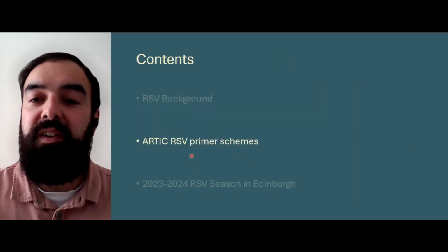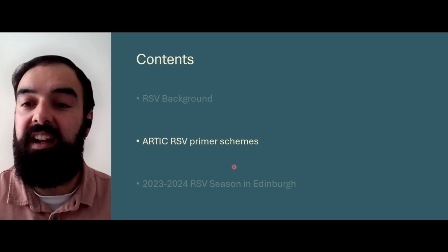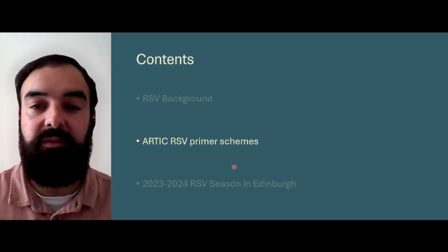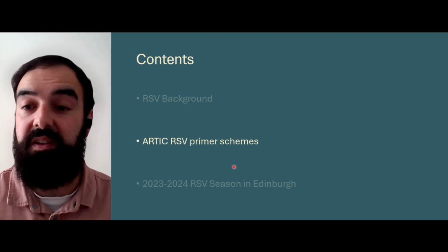So now that there's renewed focus on sequencing RSV in order to monitor how it changes as new pharmaceutical interventions come online, we felt there was a renewed need to be able to sequence it quickly, cheaply, and at scale. When we started this project in 2022, there were only a few thousand complete RSV genomes for each subtype.